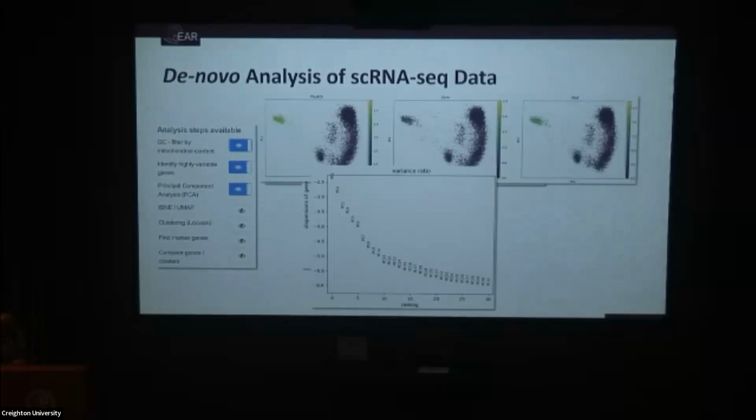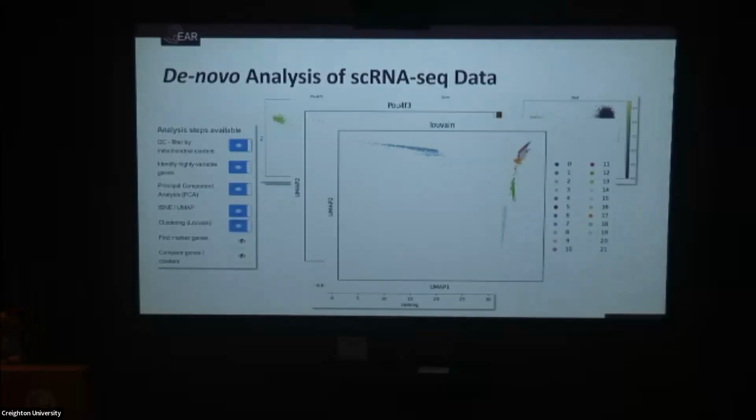So principal component analysis, and there's information to guide you for what each of the options mean. You can do TSNE or UMAP or both. Then clustering options. You could name the clusters, using the combination of the clustering and showing you the marker genes in each cluster. A lot of you know what that means, which ones are which. So then you can name them, instead of it being 1, 2, or 3, you can give them proper names. And that's what everybody else will see.